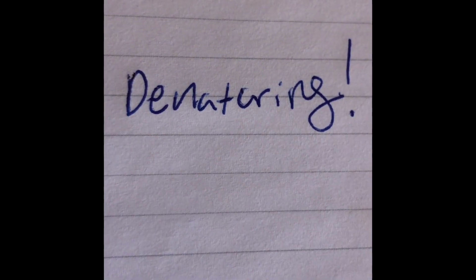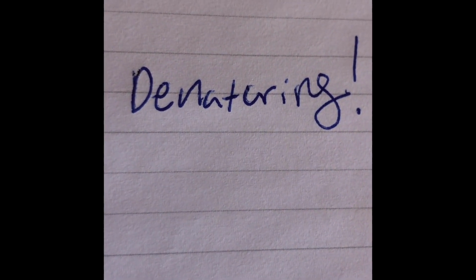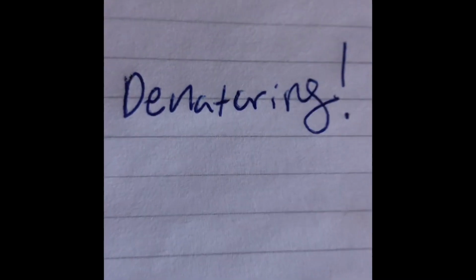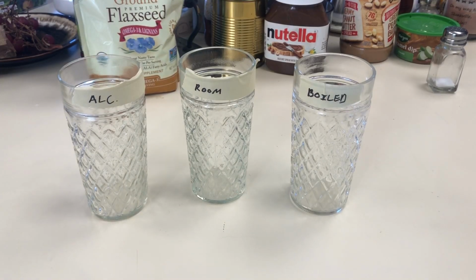Hi, my name is Olivia Barnhart, and today we will be experimenting with the effects of different substances on the proteins of egg whites. Here we have our setup with our three experimental controls.